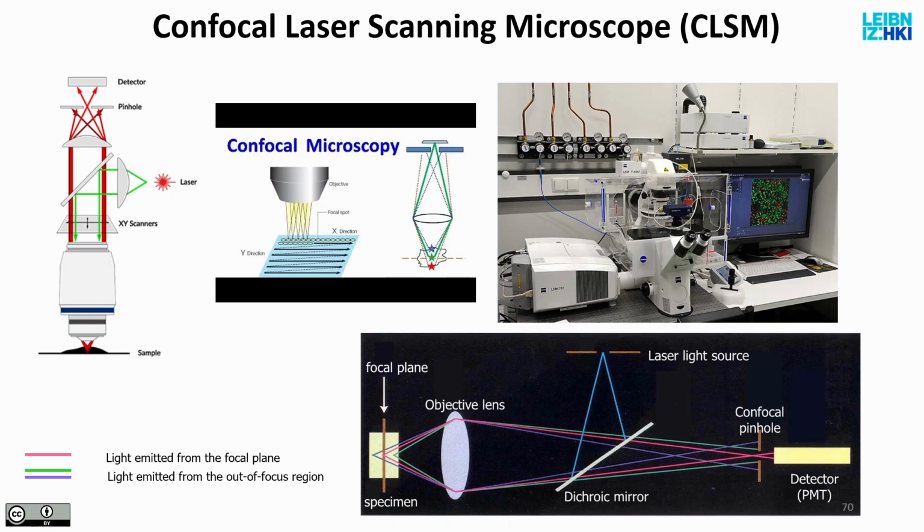So what I do is, I set up this illumination path as you saw here, but I will actually move my illumination light beam across the field, both in X and in Y direction. I go in X direction from left to right, turn the light beam around, go back, scan again, scan again.